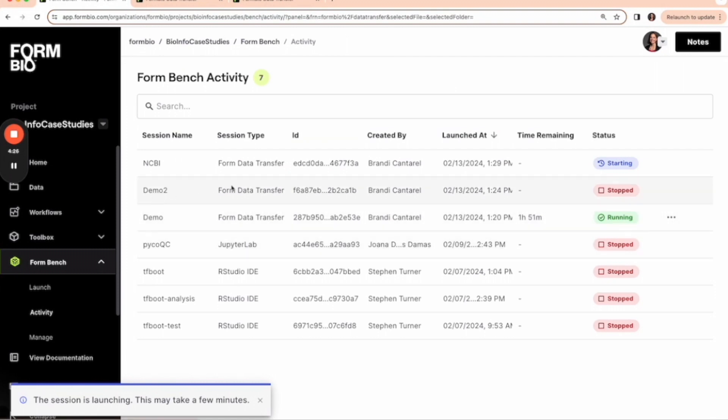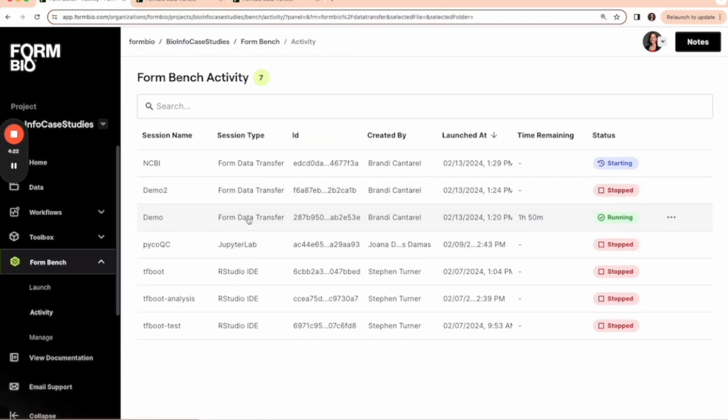I've already created an instance, so let's get started.